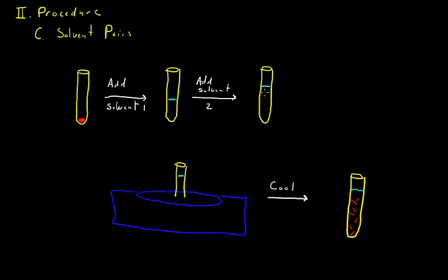So you add the second solvent, the solvent in which the compound is insoluble, and eventually, since you're making the solution less and less friendly, the solution will begin to get cloudy. And that cloudiness is an indication that you are near saturation. Actually, you've passed saturation. You're starting to see tiny amounts of precipitate form when it gets cloudy. So stop adding the second solvent at that point.